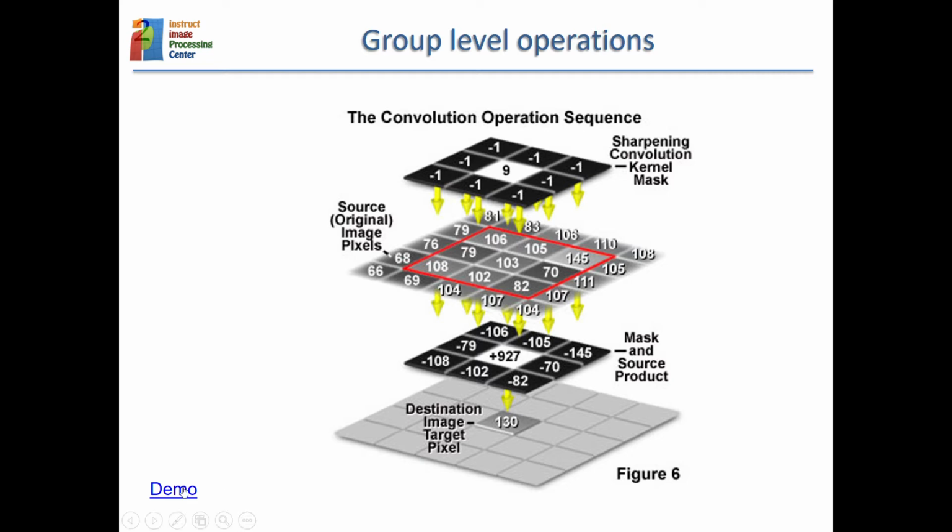Here we have a demo where we can perform the convolution step by step. Let's say that we are convolving the image that has these values, so 86, 40, 14, 82, and so on. We are convolving with this kernel. So when you do that, let's start with this pixel here.